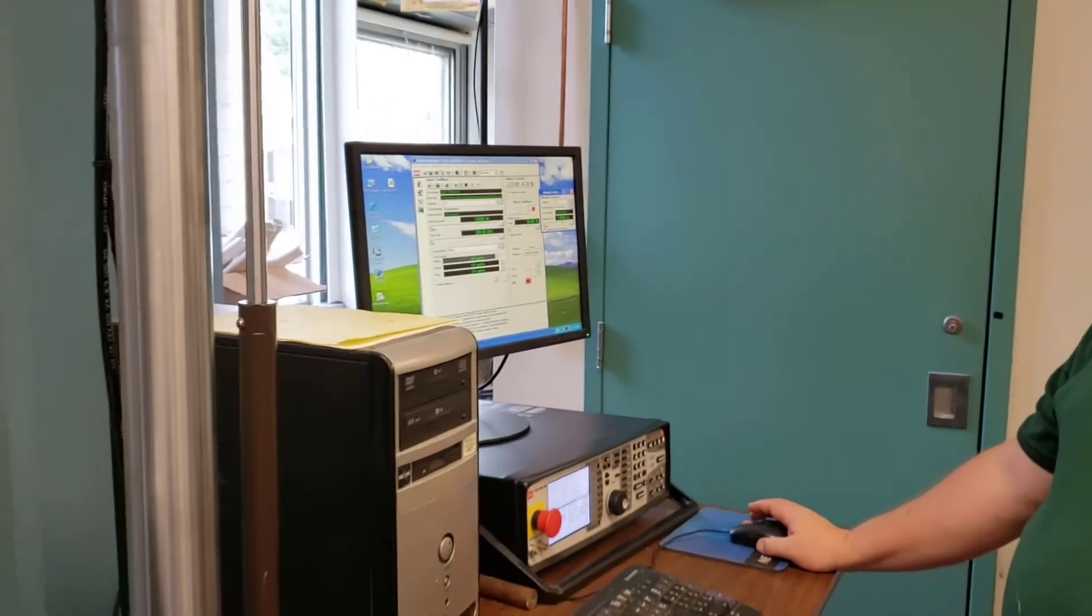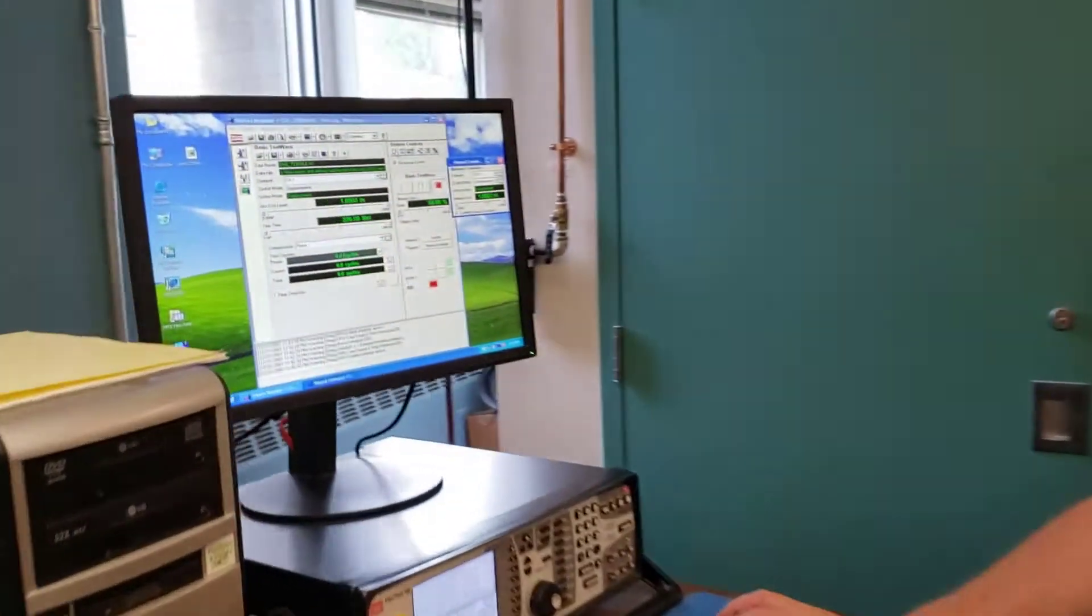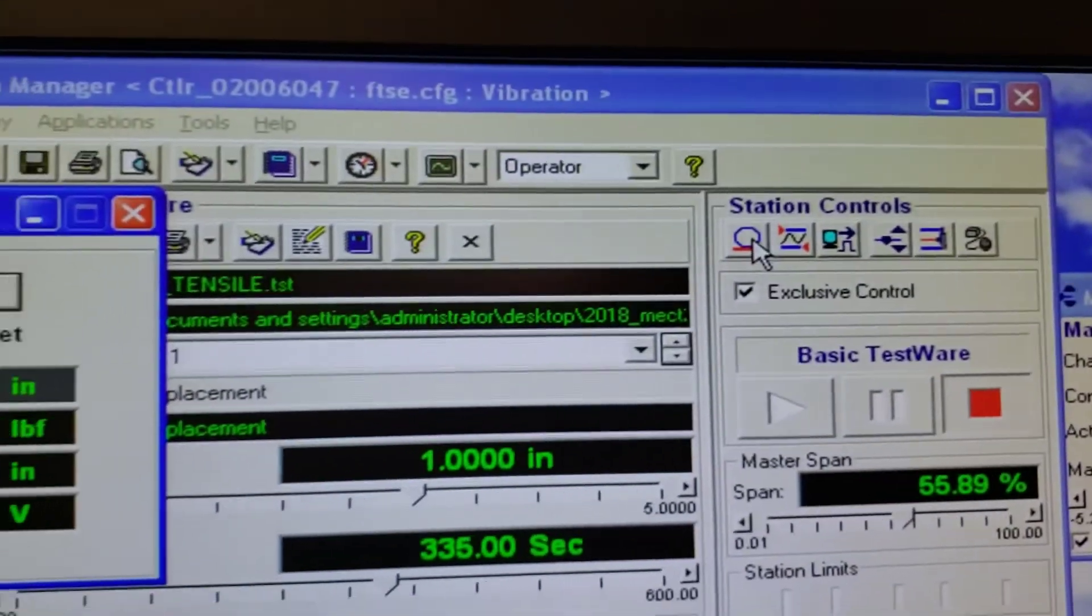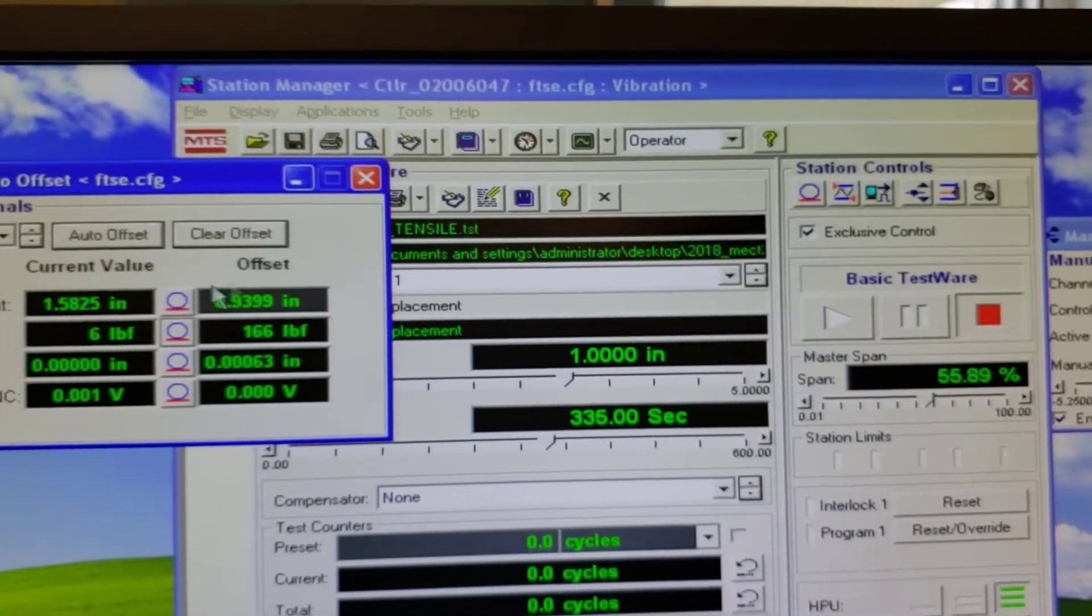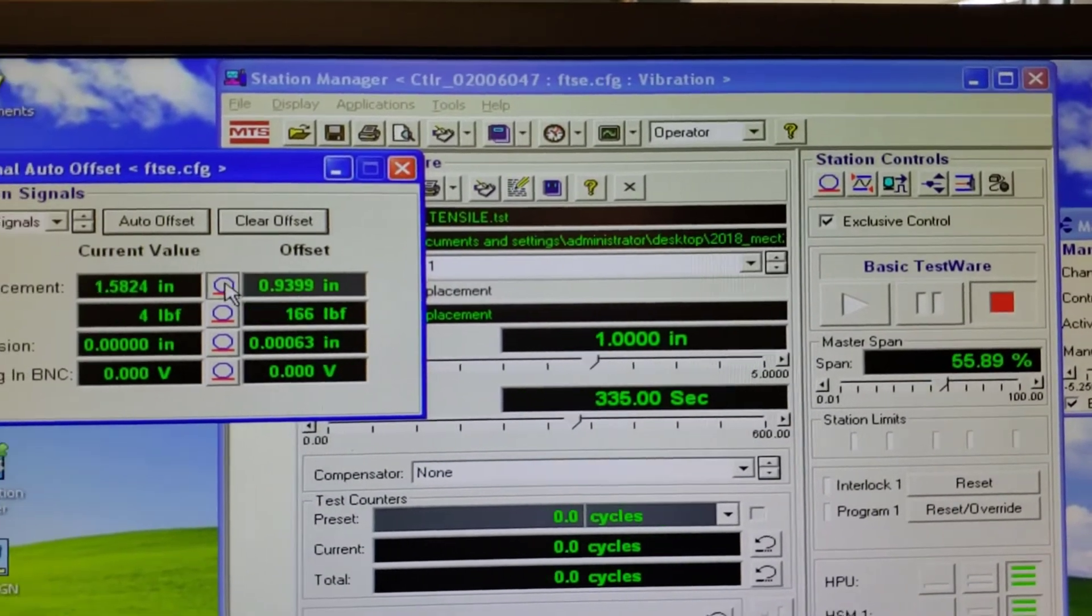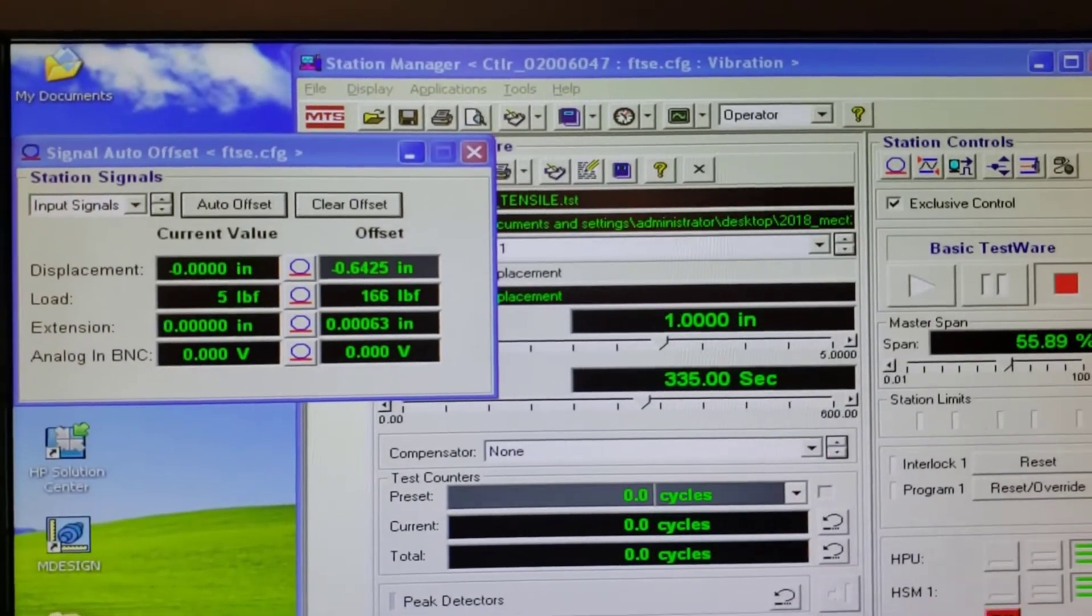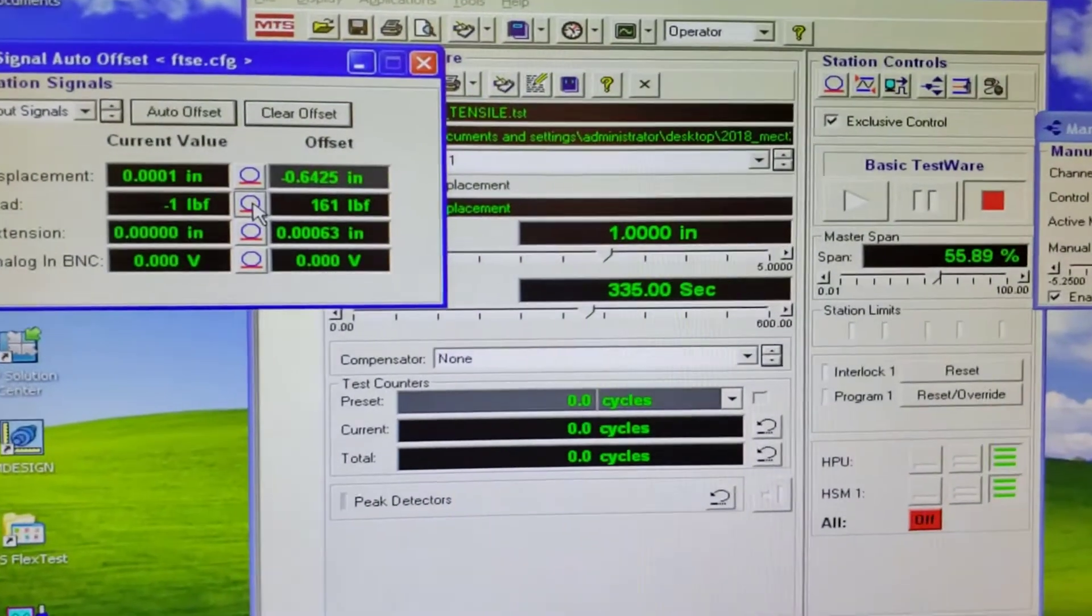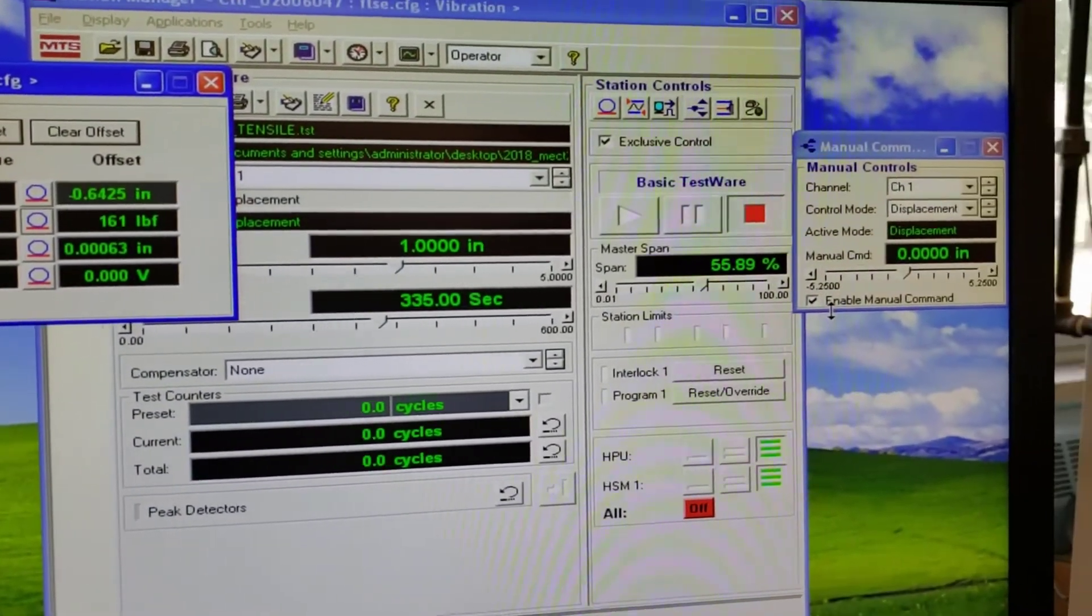And then what you're going to do is back over here under station controls is the auto set button. I'll hit auto set, brings up a new window. Each of these buttons brings up a different window. You can see my displacement is set at 1.582 inches. Now I'll hit auto set. Now it's zero, and we've zeroed the system. Very clever. Likewise, I can do that with the poundage and everything else. I can zero the system out.